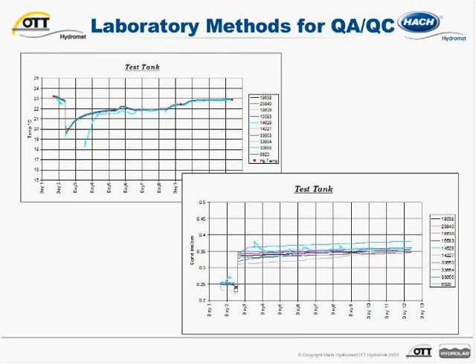Here we have temperature data in the upper left hand corner from 10 instruments that were in a laboratory tank over an 11 day period. The red squares are the QA/QC readings from a NIST traceable mercury thermometer. We can see that 9 of the 10 instruments appear to be working well with a nice tight data cluster. One instrument is clearly different from the rest, and further investigation of the instrument and system setup is required to understand the root cause of the deviation.